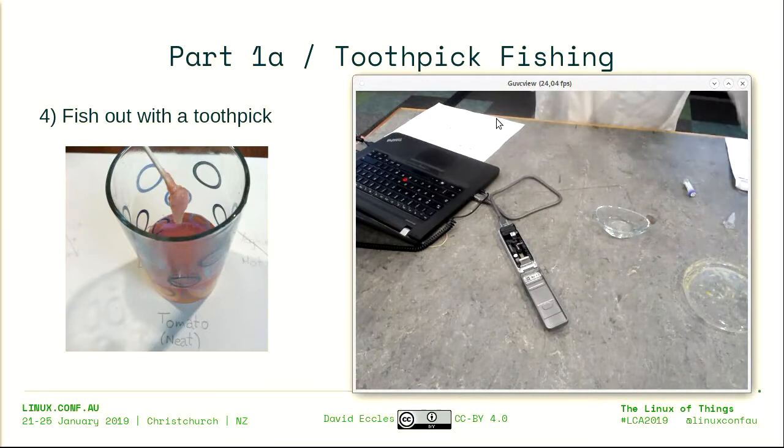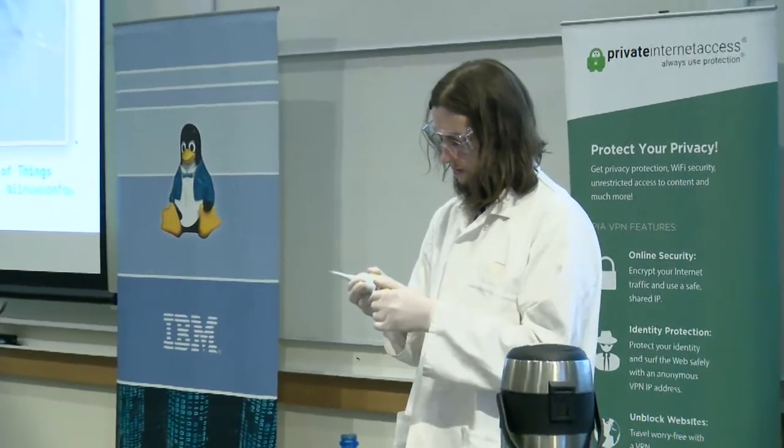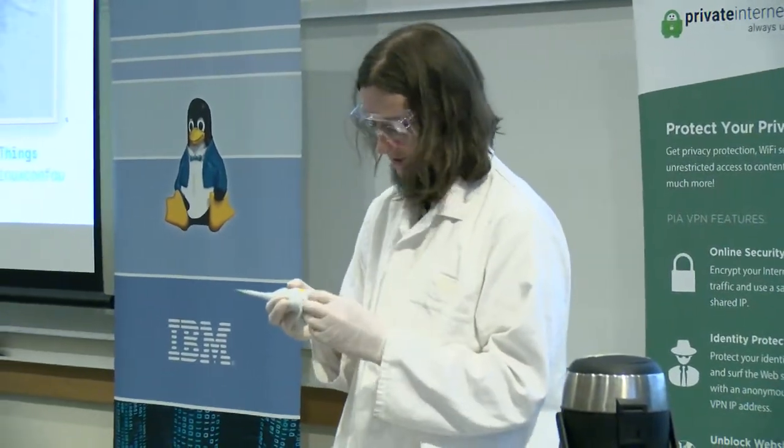Now, I'm going to transfer the liquid from there into two small tubes here. Even though it doesn't look like much, in biology, or at least sample preparation terms, it's a huge amount there.